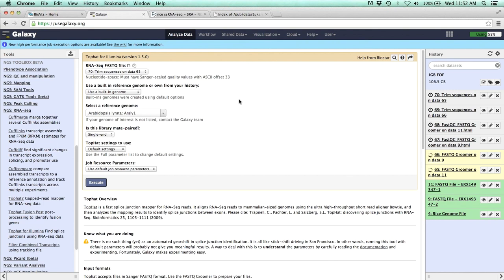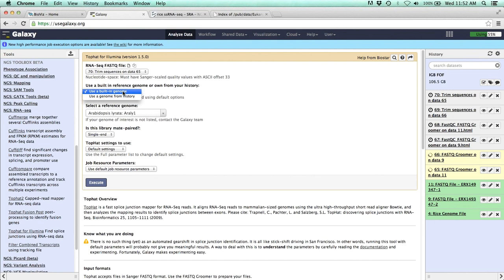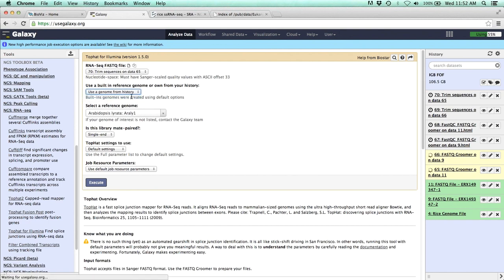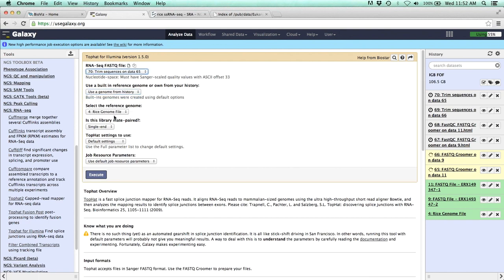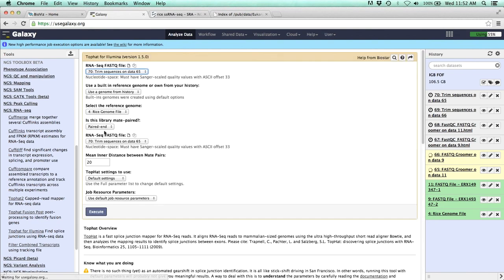So first off, we need to select our file. We want to select our trim sequences. And then here's where if you're using a well-known model organism that had a genome that was already completely set up, you could just use the built-in genome to align to. In our case, we've actually imported our own genome, and we want TopHat to align to that genome. So I'll go ahead and switch to the use a genome from history. And it's automatically selected our rice genome file. And is this library mate paired? Now this is really important because, yes, our library is paired-end. So we're going to switch this to paired-end. And then what we can do is put in that other file.